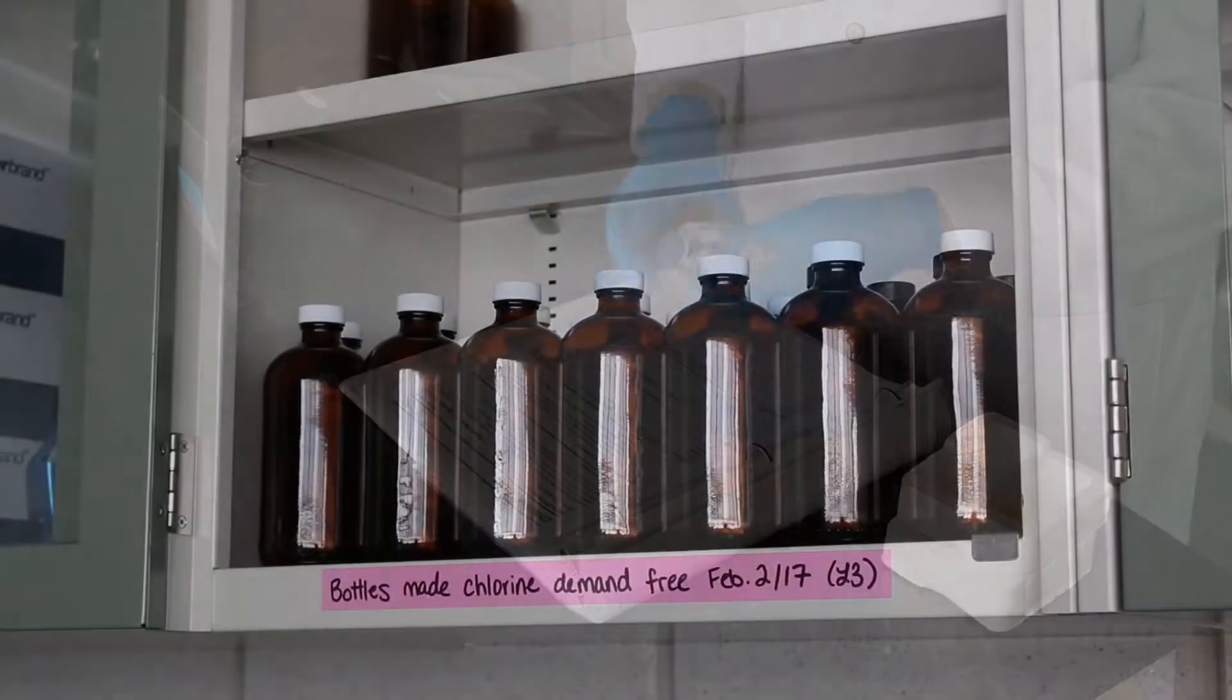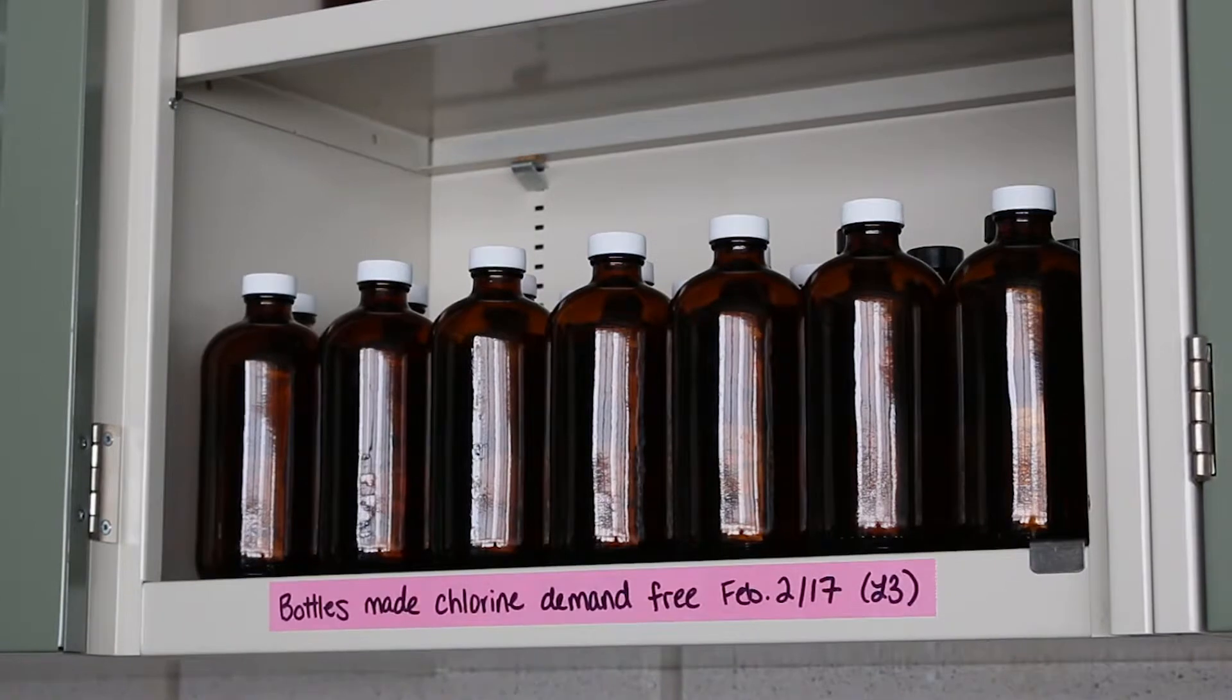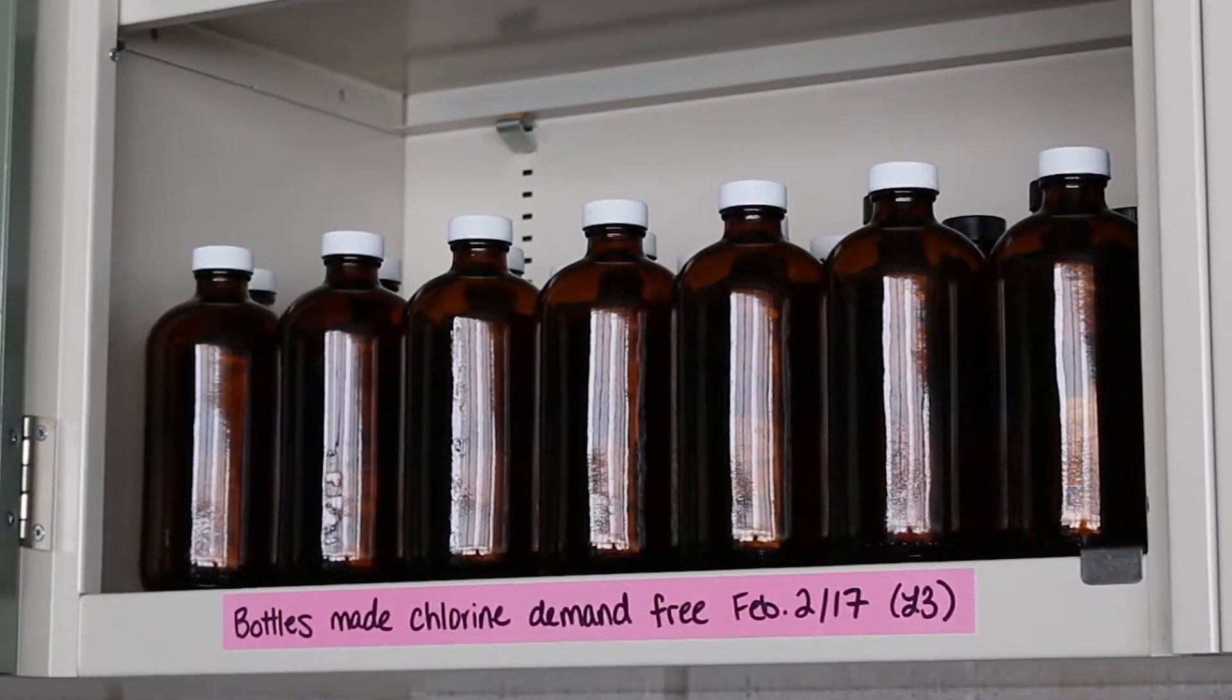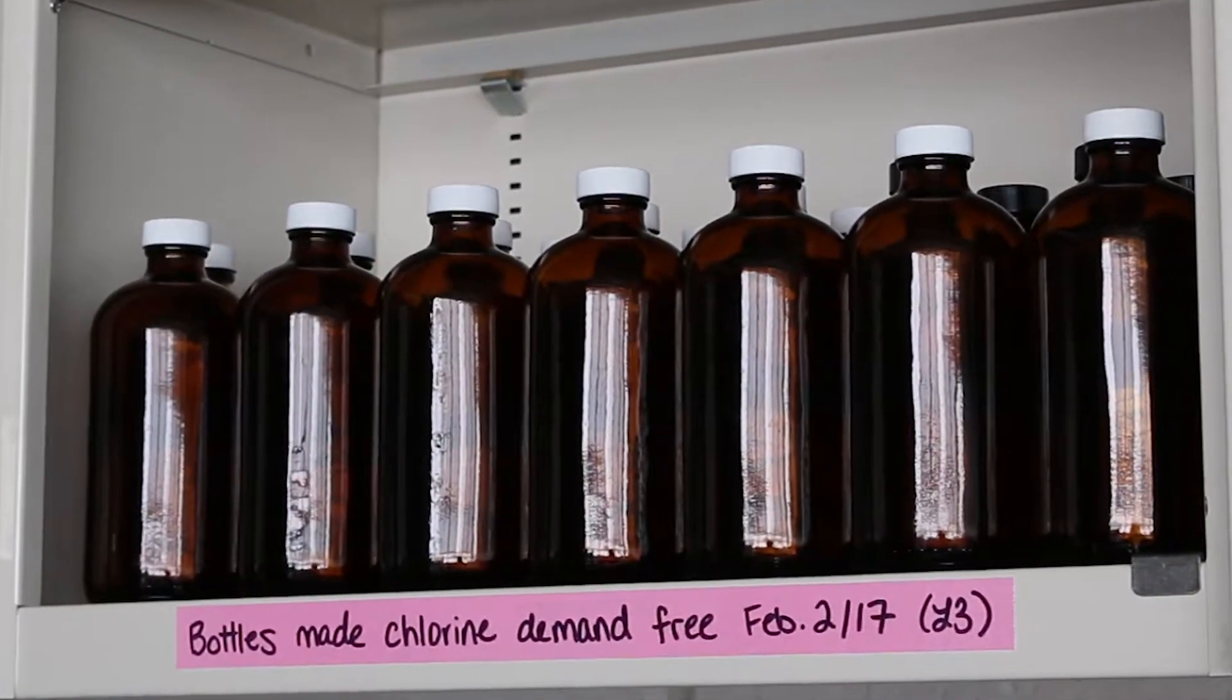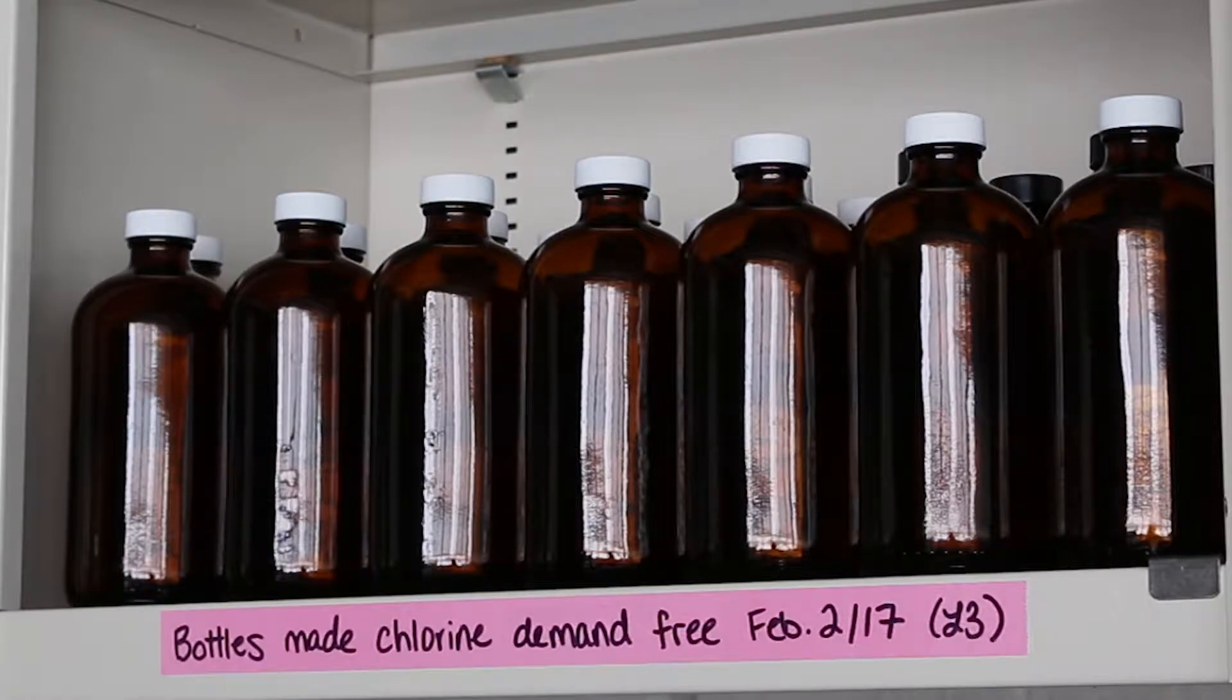Samples should be collected in clean glass containers or sample cells that have been pre-treated to remove the chlorine demand of the container material. See manufacturer method for details.